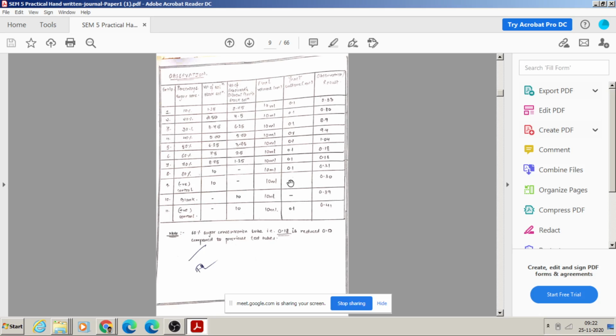So in both test tubes, when yeast is not given, the test tubes are used for checking your results actually, but the experiment begins with a blank. You know that the colorimeter reading is possible only once you put your test tube in as a blank. So the test tube in which there is only diluent, with no yeast and no concentrated solution, is referred to as the blank test tube.